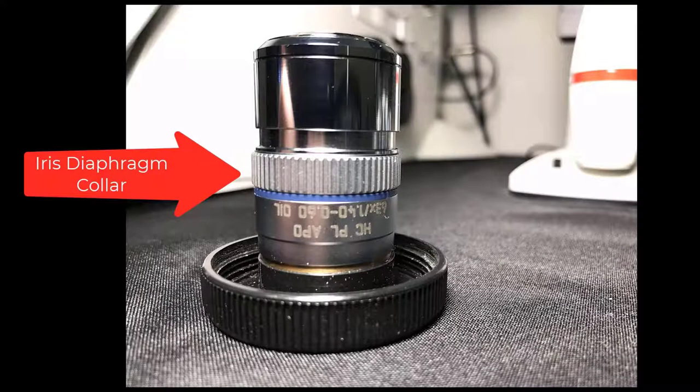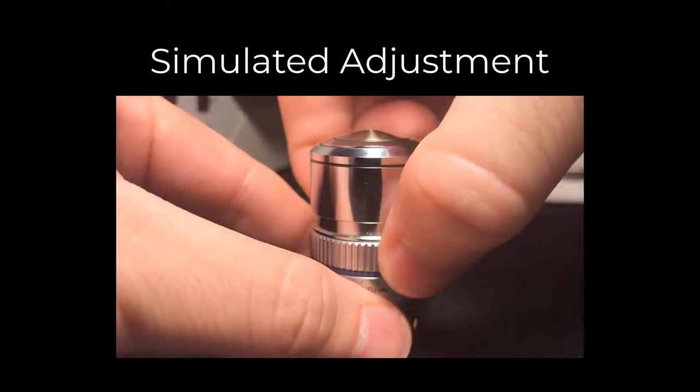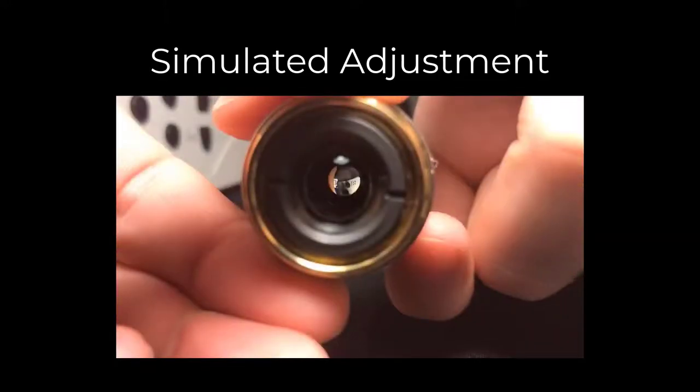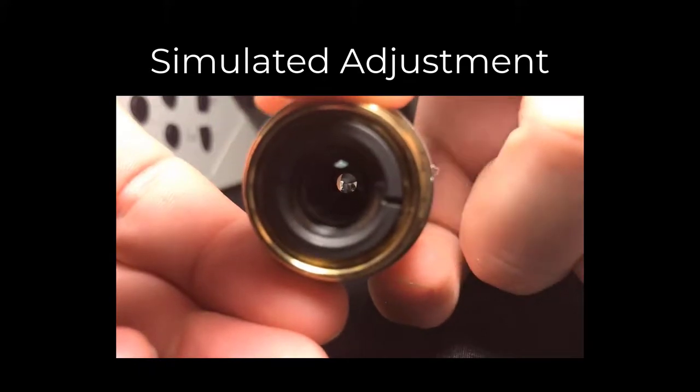The last objective we'll cover today is the 63x 1.4 NA objective. This objective has an iris diaphragm for the adjustment of the effective NA. By adjusting this iris, the NA of the objective can be adjusted from 0.6 up to 1.4. By looking down the barrel of the objective, we can see the iris open and close as the collar is twisted.